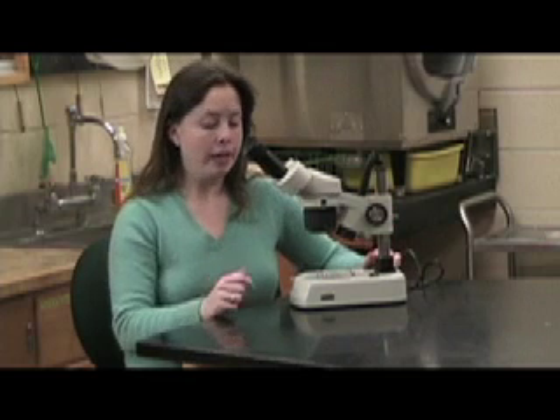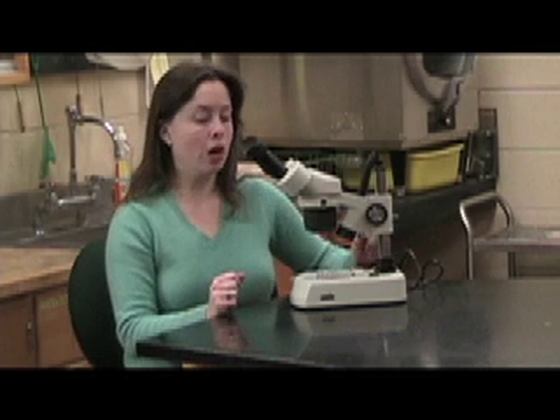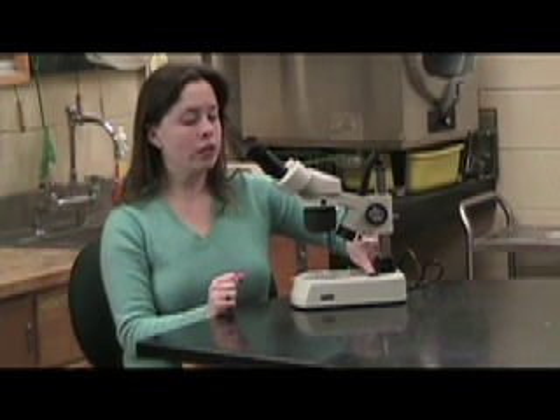This microscope also has two light sources. I can have light come from the bottom underneath my specimen, or light come from the top, or both. Here is my top light and my bottom light. There is a main light switch on this side which will turn everything off, or I can turn them both on. It depends on how you want to view your specimen.